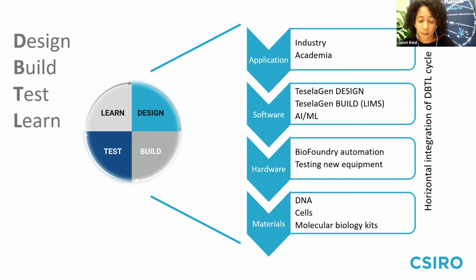We've talked to members of the synthetic biology community and other biofoundries and developed a consensus list for us to pursue in our purchases. Layer on that the software necessary for the high throughput design, instrument maintenance and management, and data handling. And finally, on top, the point of it all: the application and our service delivery to customers that can be from industry or academia or anywhere in between.